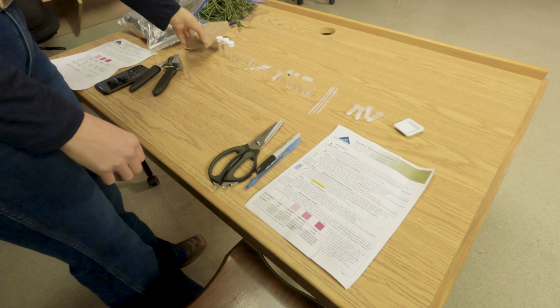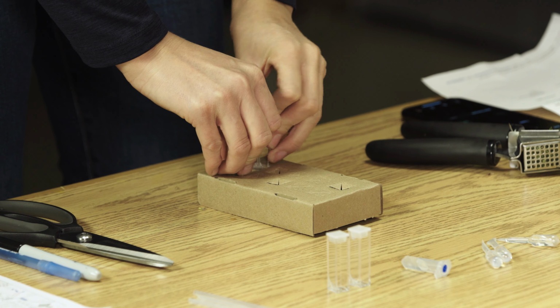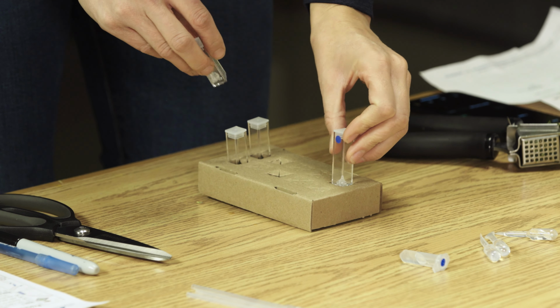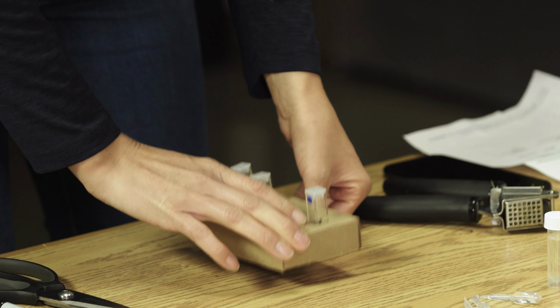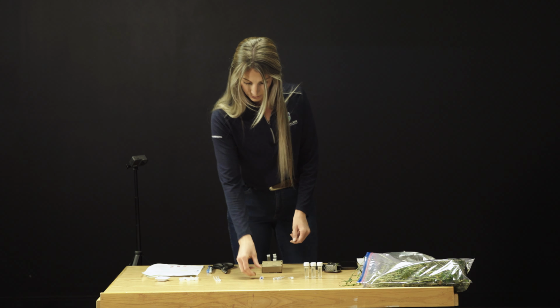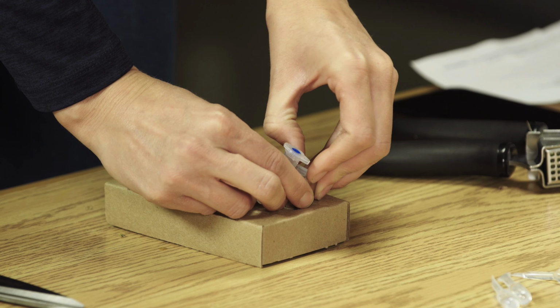Next, you will take your cardboard holder and put the square cuvettes into it, keeping the blue dot separate. Then tap it gently to settle any contents. We'll then take the standard and empty it into the corresponding blue cuvette.